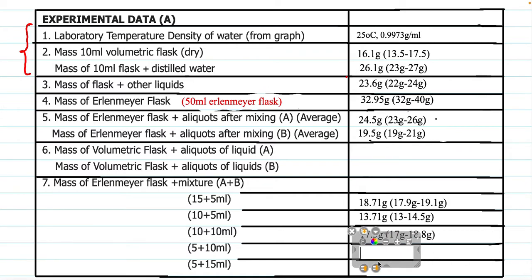Now for this one here, we have 12.7 grams. All right, so your value should be within the range of, let's say, 12 to 13.7 or thereabouts. But if your answer is slightly above this 13.7, you're still very correct.